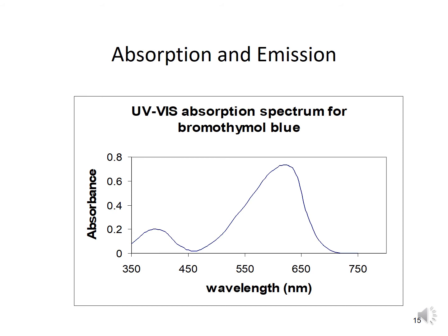Bromo blue has a lambda max, or maximum absorption, at more or less 625, I guess.